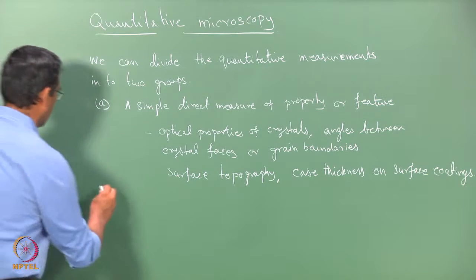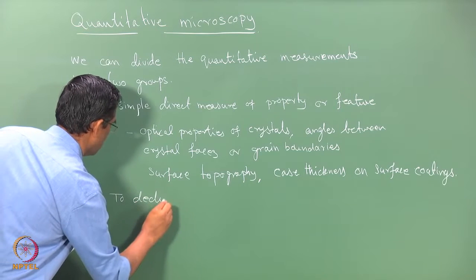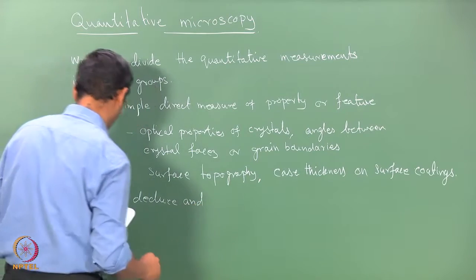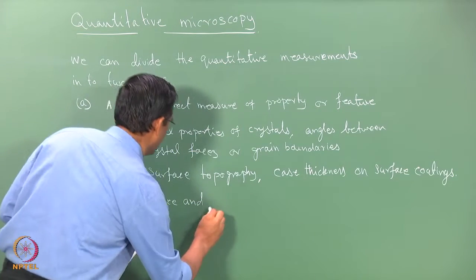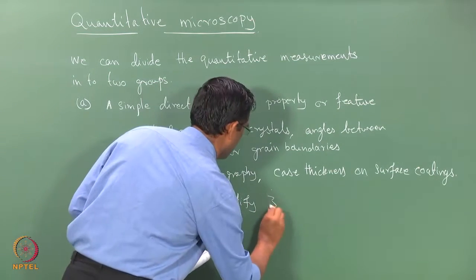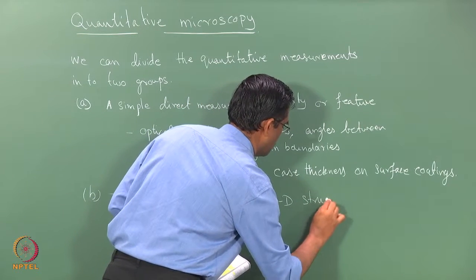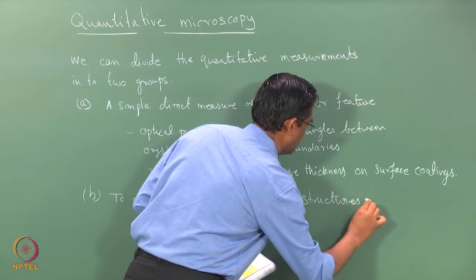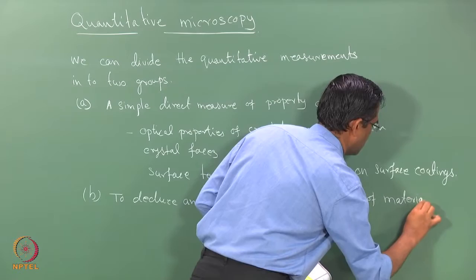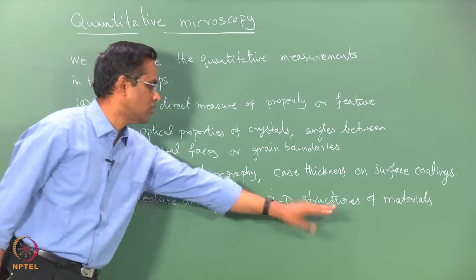The other one is to deduce and quantify three-dimensional structures of materials.